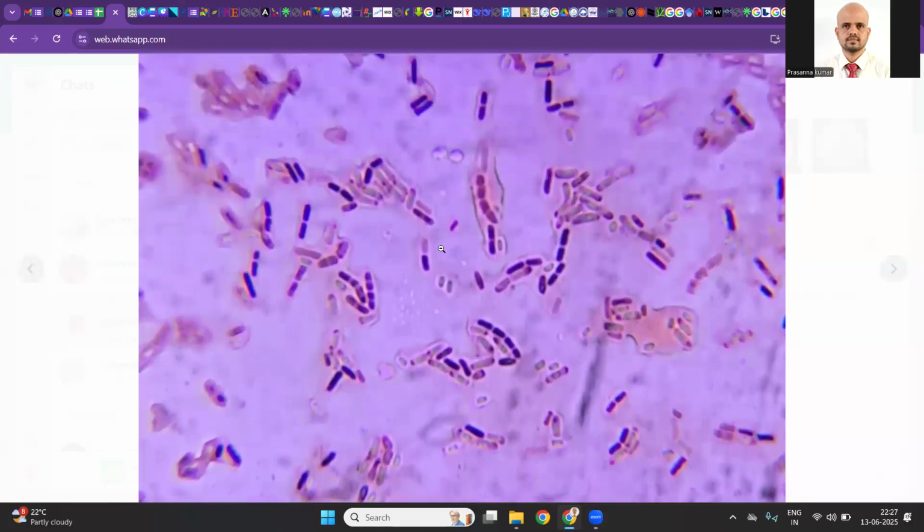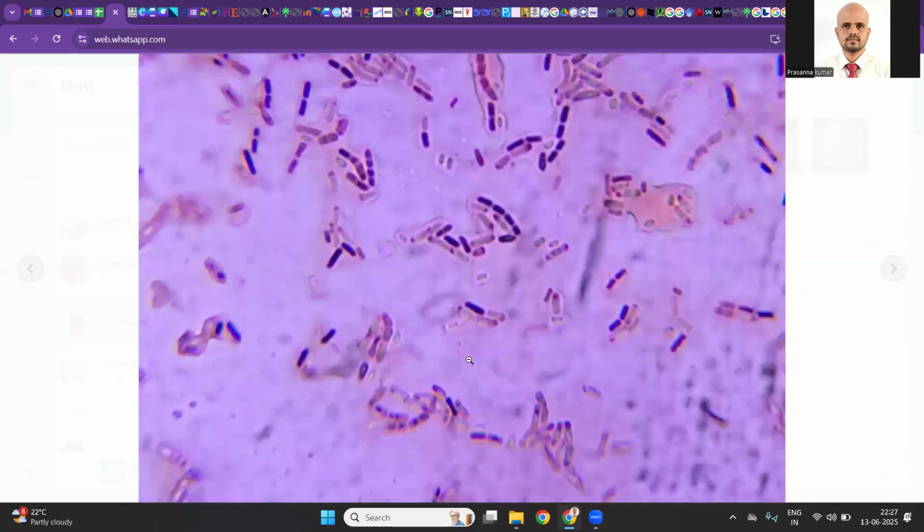Seeing you have differentially dye-absorbed cells in this field of view, meaning the cell wall composition, even though you subjected every smear, it's the same smear, right? For the same duration of time, there is a differential absorption of crystal violet. That's the first indication that something is wrong.